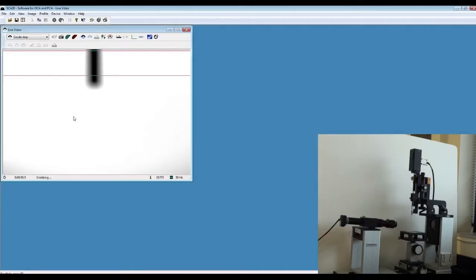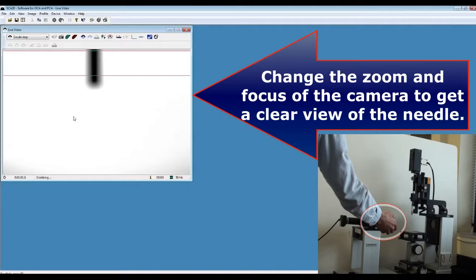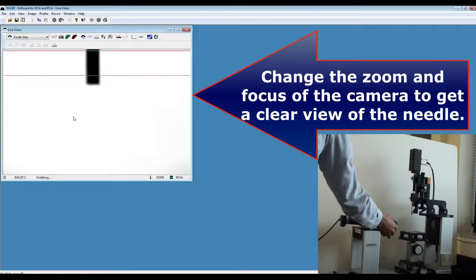Once the needle is in the live view window, make sure you focus on the needle to get a sharp image.